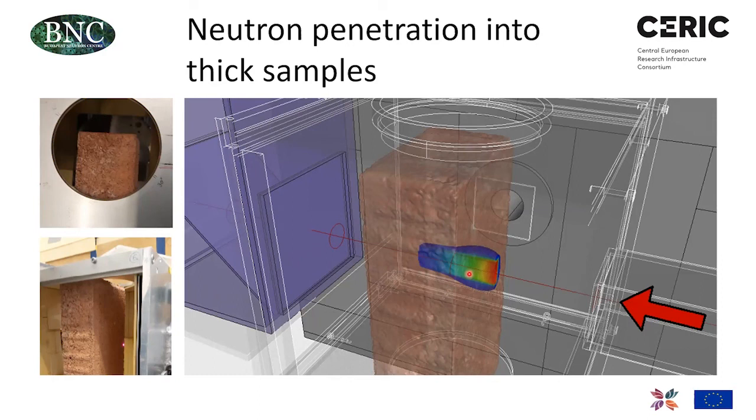And if the object is rather large or has a complex shape, we need to account for the self-absorption and self-shielding of neutrons and gamma rays. And this can be facilitated by a technology called Monte Carlo calculation, where with computer simulation, we follow the propagation of radiation within the sample and within the sample geometry, detector geometry.